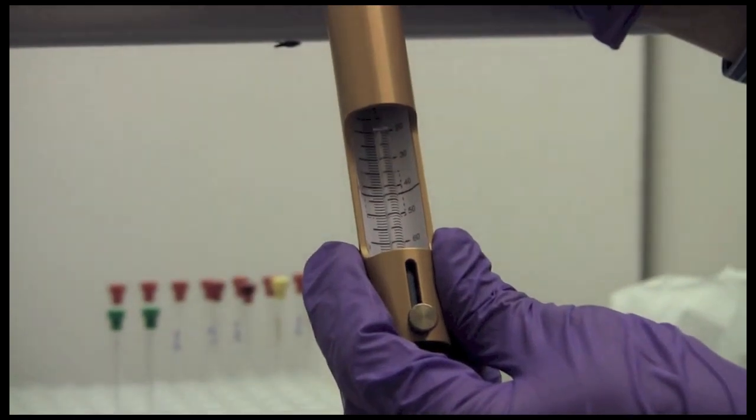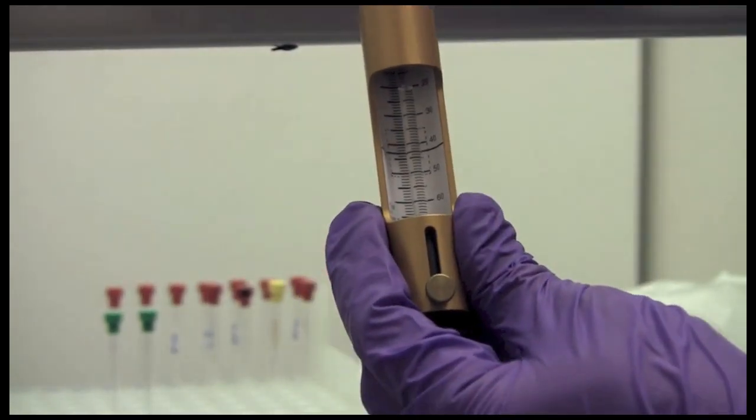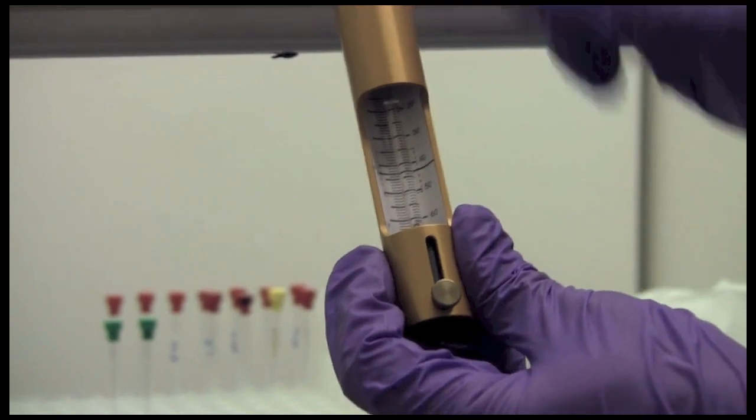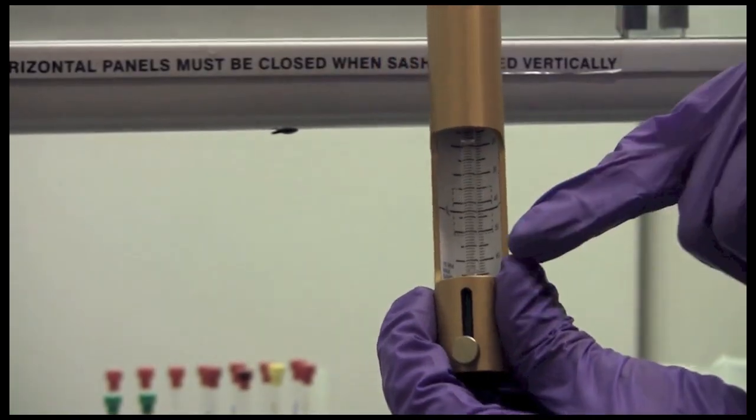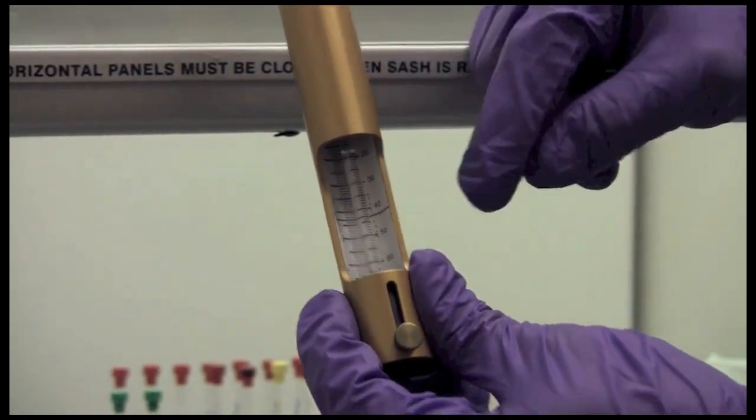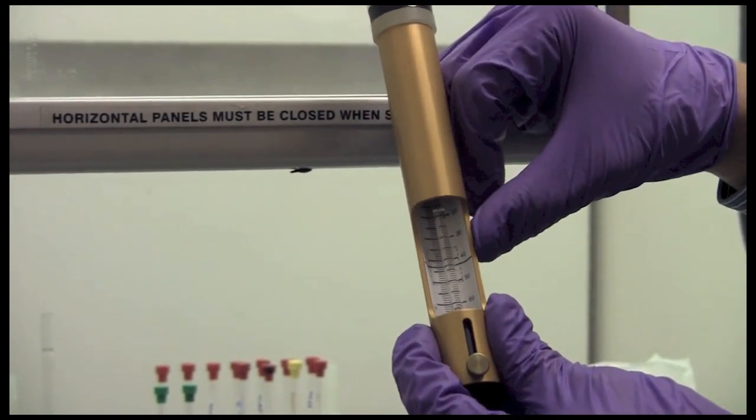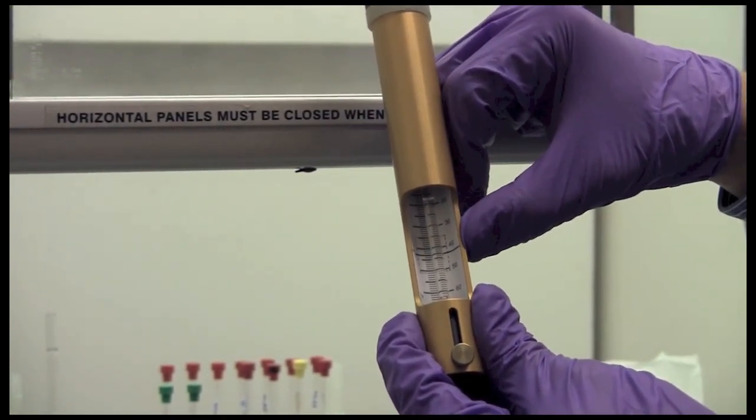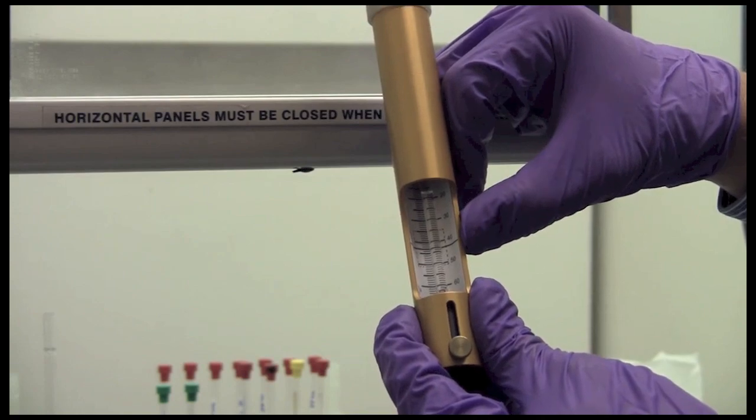If your sample is tall enough you can just push it down to the bottom of the depth gauge. If it is not tall enough, then what you want to do is center it on this center line. It is actually marked CL for center line. The dashed box here indicates the volume of the sample that is actually being observed. This is the part where the coil is.